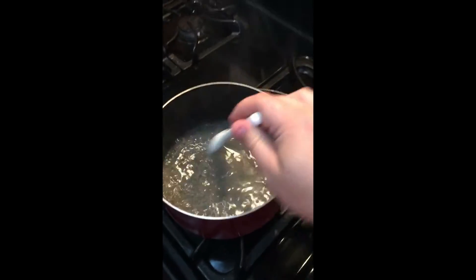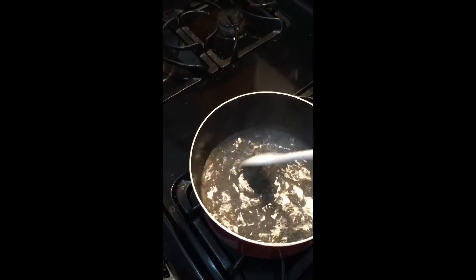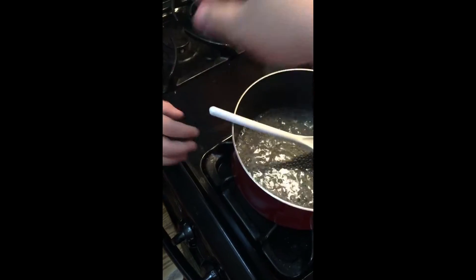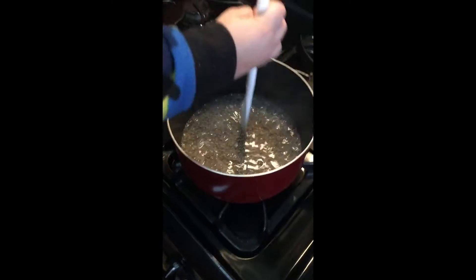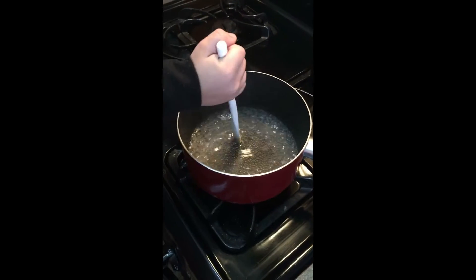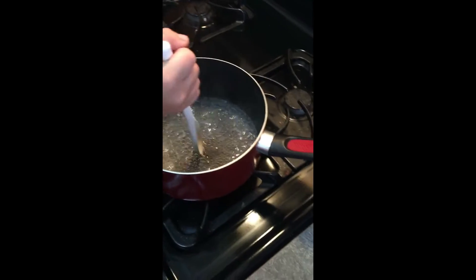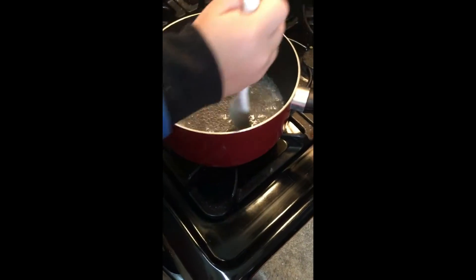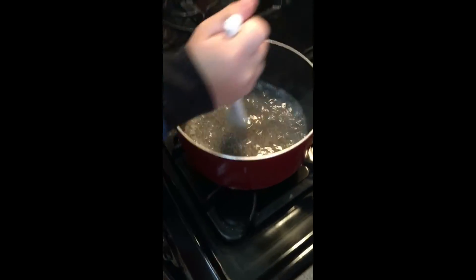We're stirring and stirring. You can still see some agar in there. Nobody's going to get to stir except Graham because everyone's fighting. Joel and Carmen, quit fighting. Keep stirring — it's bubbly!